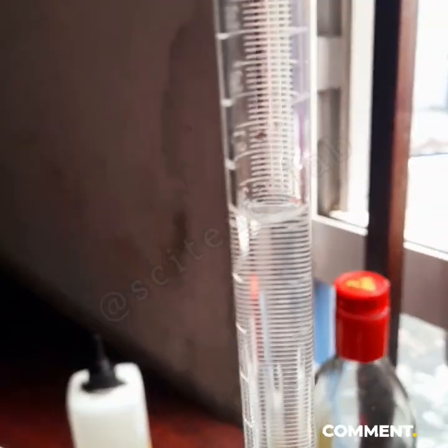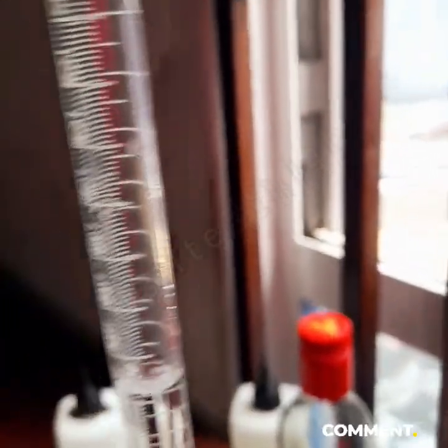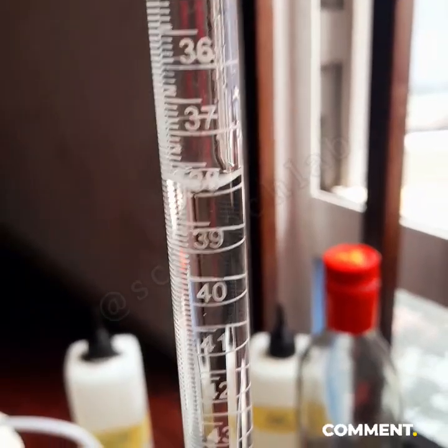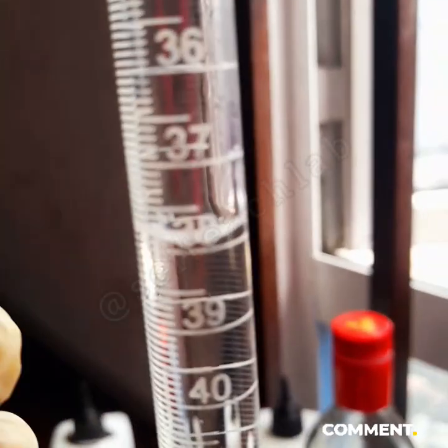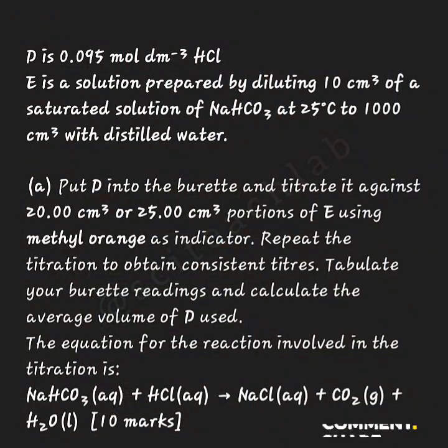What's the volume of the acid in the burette that has been used up, and then you record that. You rough and repeat the process 2 more times to have consistent titers to find the average. All right, so let's get back to our question. The question said to put the acid into the burette and titrate it against 25 cm³ of the base using methyl orange as indicator. We've done that. We have to repeat that same process to obtain consistent titers, and then tabulate the readings, the burette reading, and calculate the average volume of the acid used.